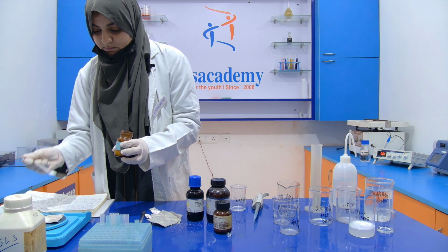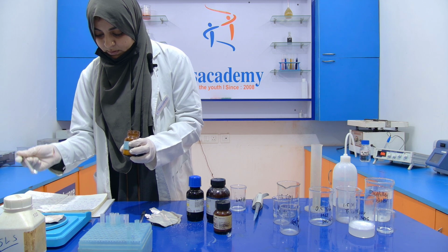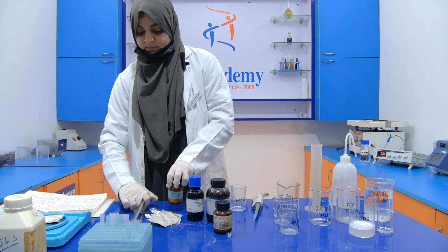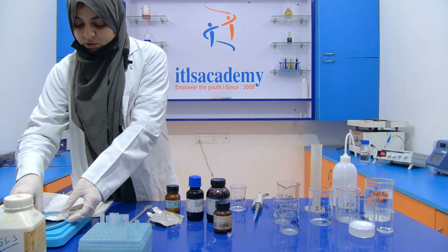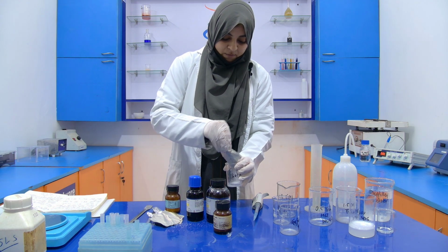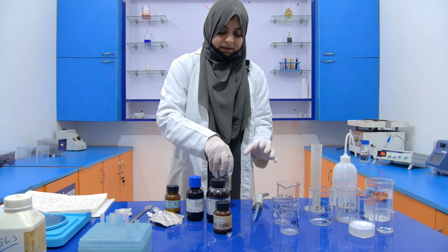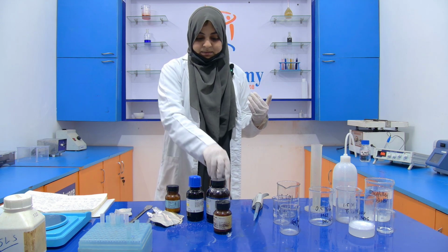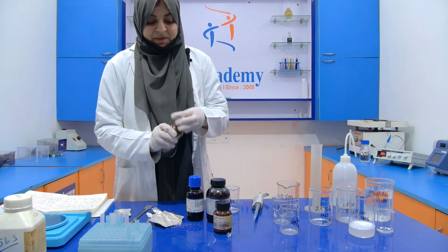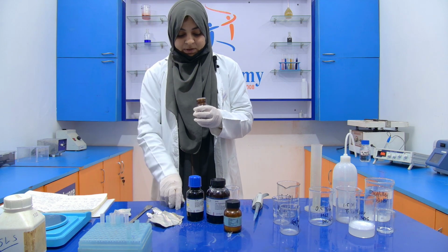1.41, 1.44, and it is 1.46. Now dissolve this 1.46 gram of acrylamide into 5 ml of distilled water. Now the other chemical that we require here is bisacrylamide. And the amount of bisacrylamide that we require is only 0.04 gram.